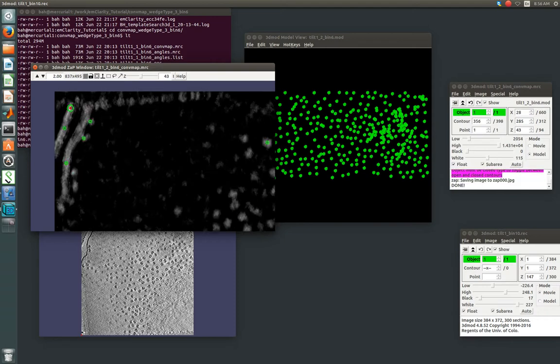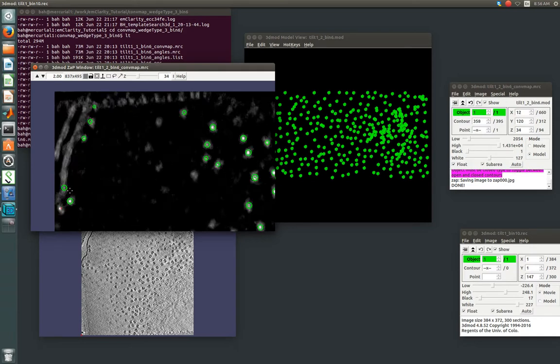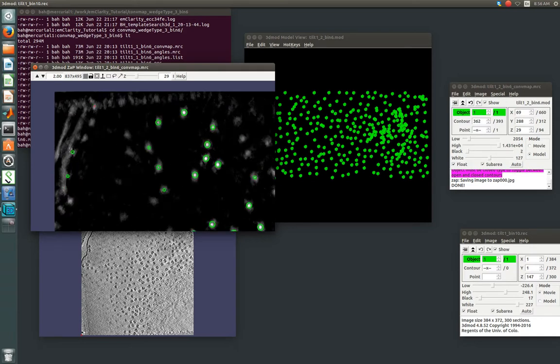So you can just right click on points that you decide you don't want, which here, this carbon edge, obviously we don't want. And we're going to delete it.